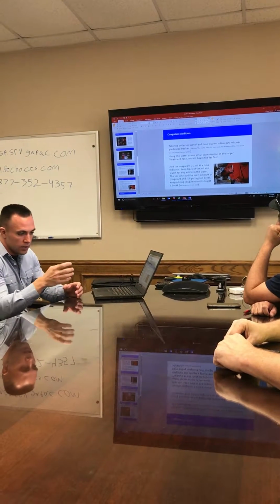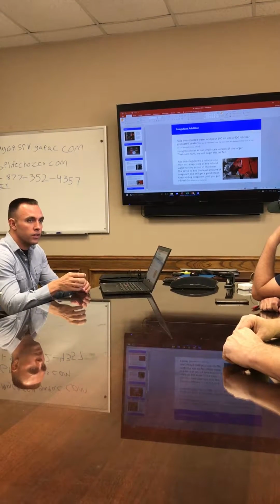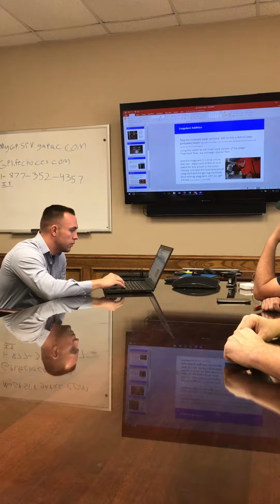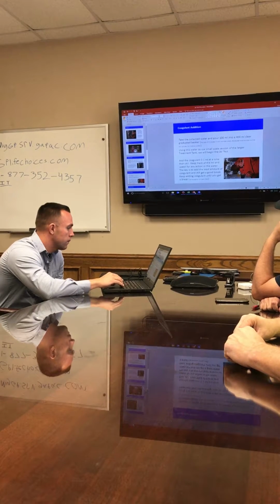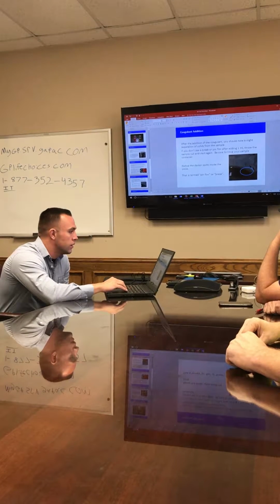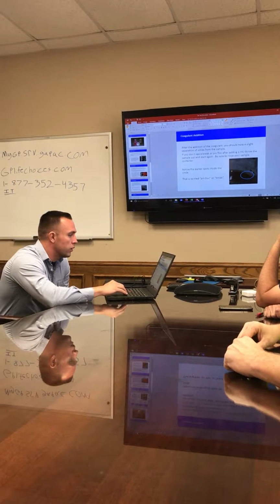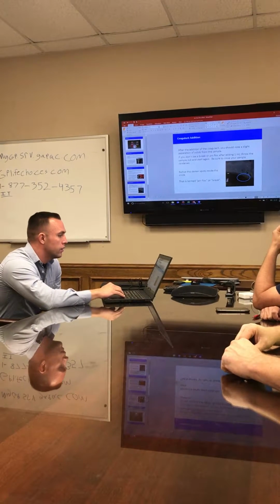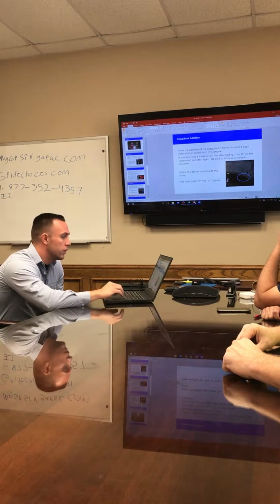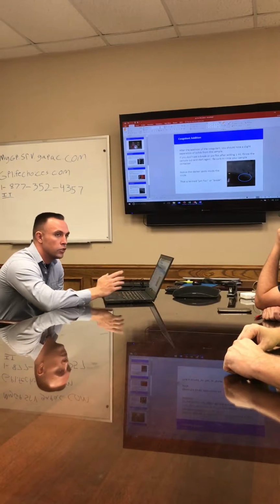And when it says break, you can kind of see the water basically emulsifying in that little sample container. You can just start seeing it break up, start seeing clear water around the edge. So just keep an eye out for that when you're adding your coagulant. After your coagulant addition, you should note a slight separation of solids from the sample. If you don't see a break or pin floc after adding 1 milliliter, that'll be a whole syringe full of chemical to 1 milliliter. That's a lot of chemicals. So if you're not getting a break, just throw it away and try again.